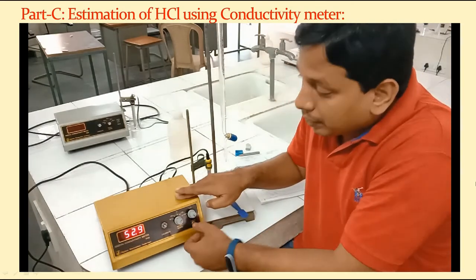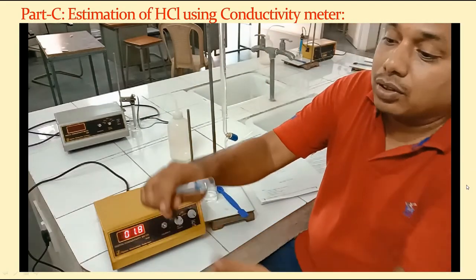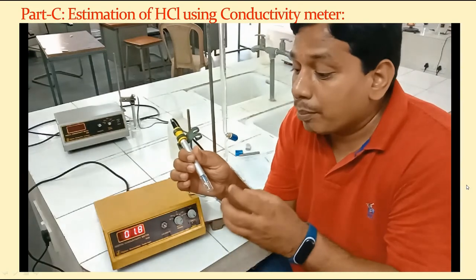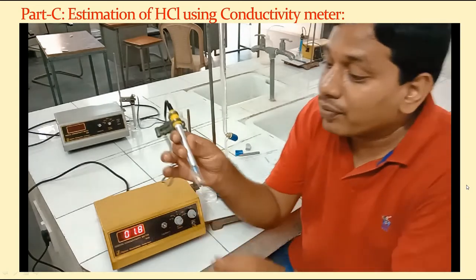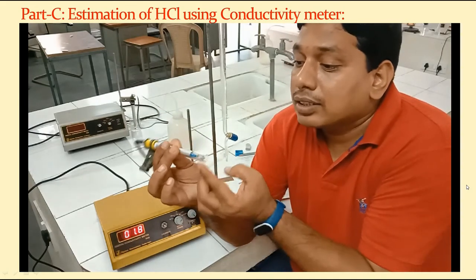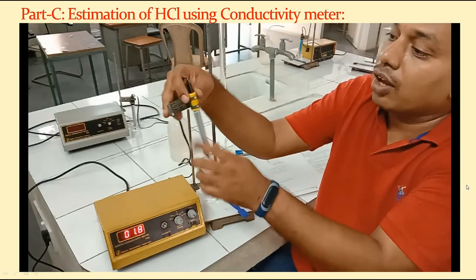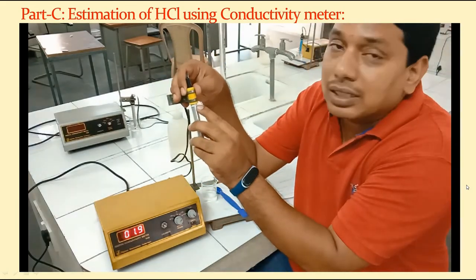Now I keep it in the read mode, and the important part is the conductivity cell. This conductivity cell is an electrolytic cell, which means by passing electricity we can bring out a chemical change. It is a non-spontaneous reaction; we bring out the change by passing electricity. That type of cell is a conductivity cell. Here we have two platinum electrodes, on this side and the other side, enclosed in a glass tube, so their distance is fixed. The cell constant of this conductivity cell is given on top of the cell. It is given as 0.97, so close to 1.